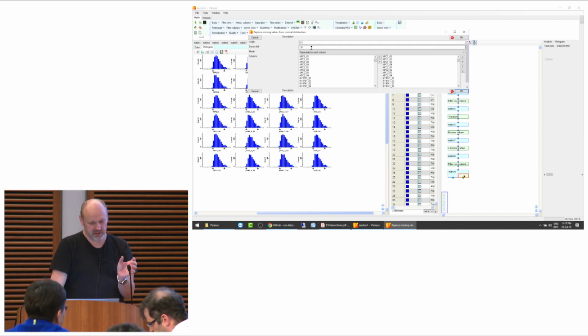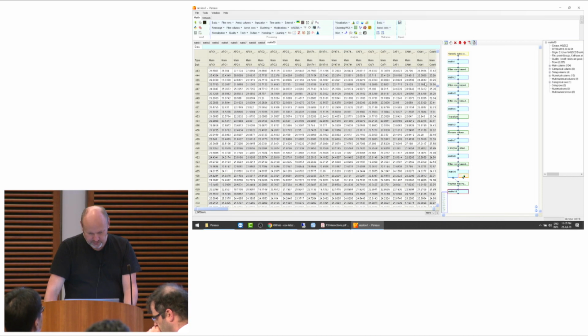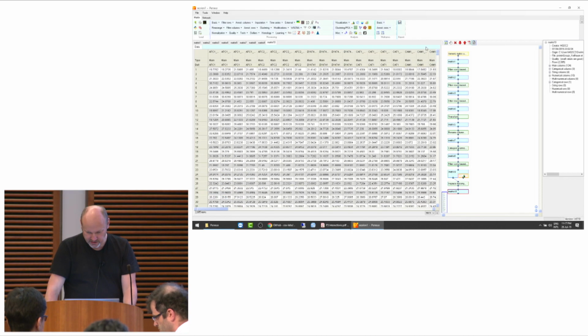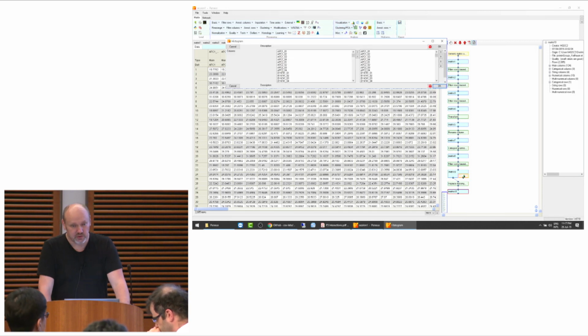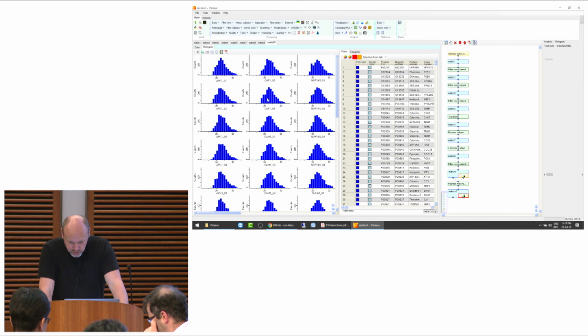So you squeeze it a little bit, and you shift it down by 1.8 standard deviations. Right. So let's see what it does. Okay. So first of all, now you end up with a matrix that has only valid values, as it should be after imputation. And then let's have a look at the histograms again, what it did to the data distribution.